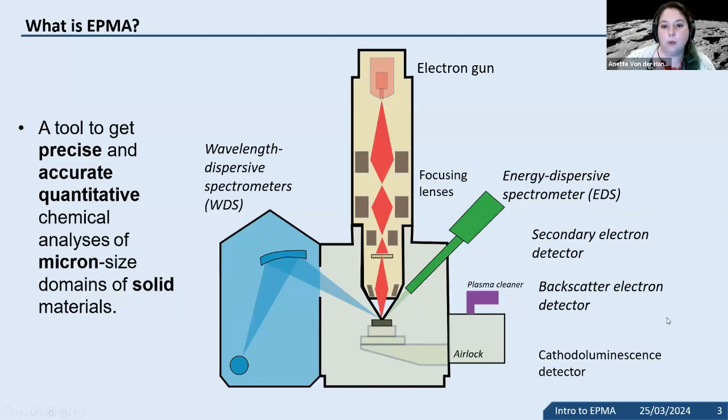And another common thing that we find with electron microprobes is that in contrast to certain scanning electron microscopes, we usually do not vent the entire machine. We only vent a small airlock and use it to introduce the sample, as otherwise the pump down time with all these detectors would take too long. And then finally, what is important is that electron microprobes are specifically geared towards stability, because compositional analysis can be many minutes long, and when we do X-ray maps.